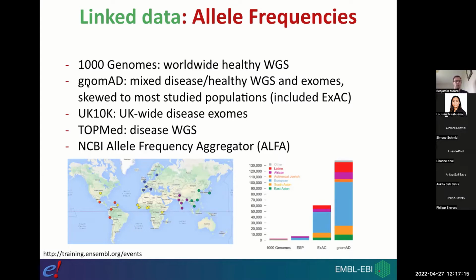Then we also import allele frequency data from gnomAD, which has mixed disease and healthy allele frequency data. Then we also import the same sorts of data from the UK10K project, TOPMed, and the NCBI ALFA project as well, the allele frequency aggregator.